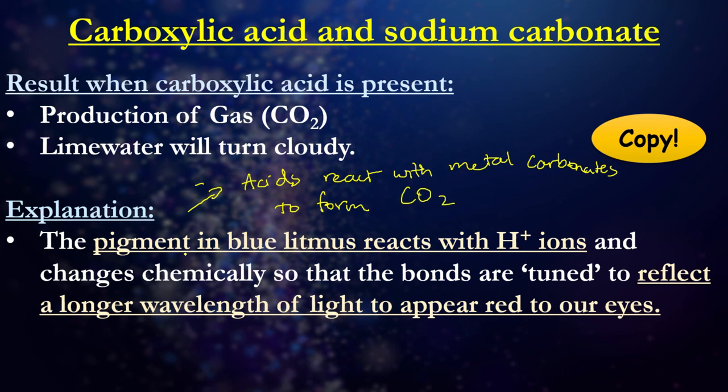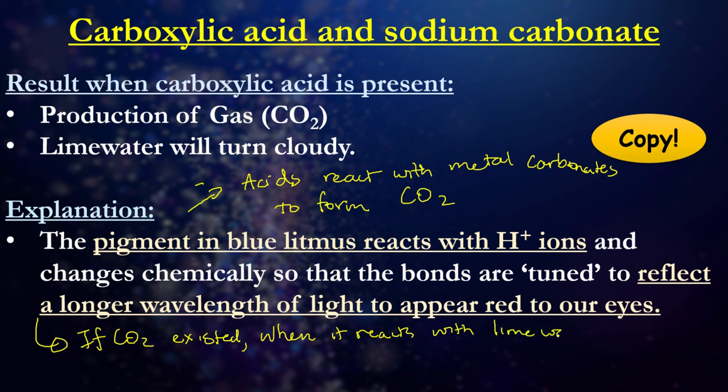Okay, now if CO2 existed, when it reacts with lime water, a precipitate is formed.